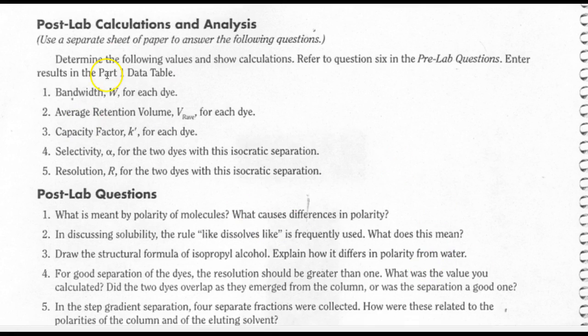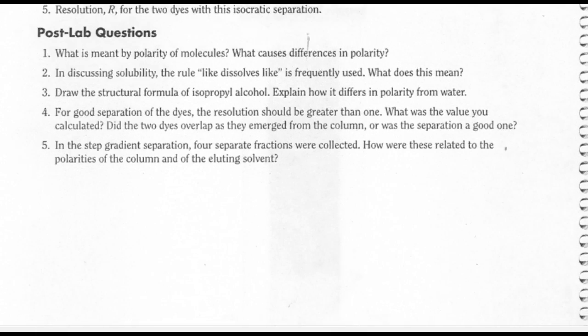So you notice that here are the post-lab calculations. Again, some of those you will need to calculate an average for. I would definitely recommend reviewing those sample calculations, especially if you have not done those yet, to help you with that. In terms of the post-lab questions, you have 5 questions.